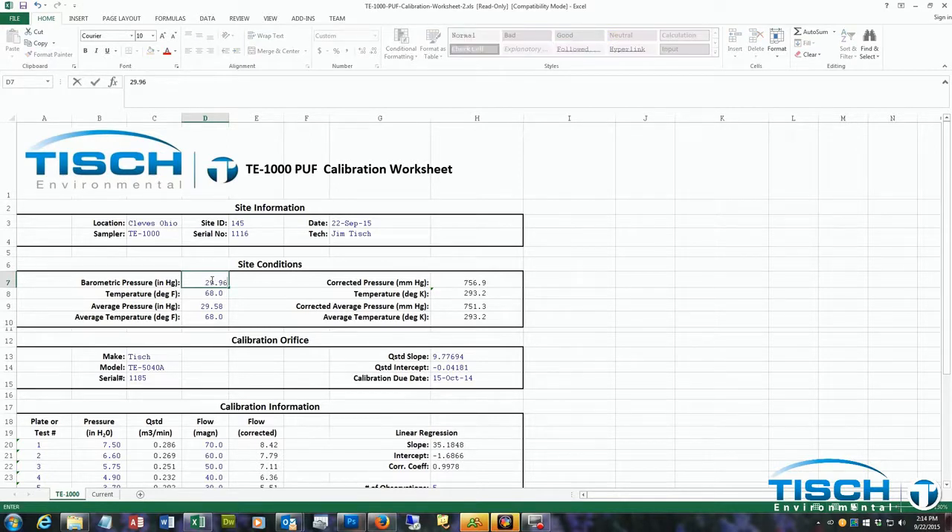Next are the site conditions. In our example, the barometric pressure was 29.96 inches of mercury and the temperature was 70 degrees Fahrenheit. Next is the calibration orifice — enter the serial number, the Q standard slope, and the Q standard intercept. The slope in our example is 9.89525 and the intercept was negative 0.04826. The calibration due date is one year from the first calibration of the orifice.